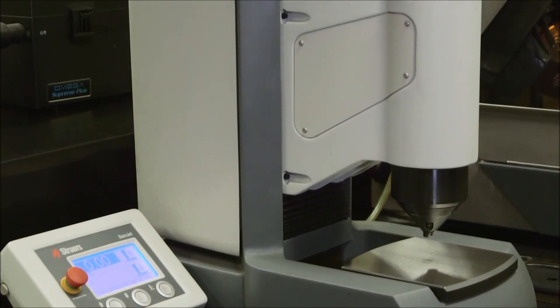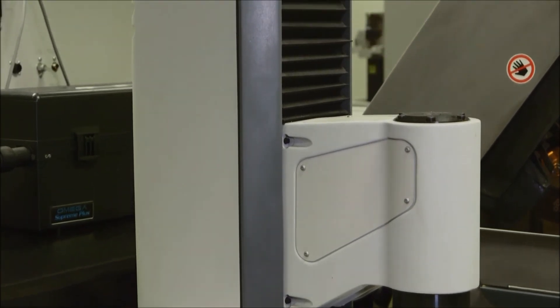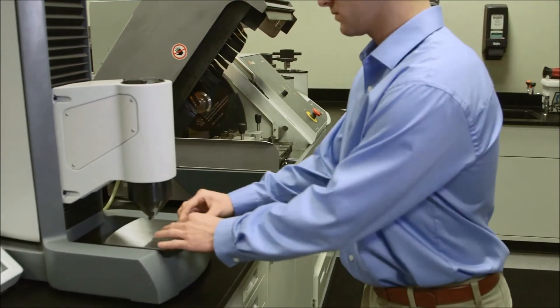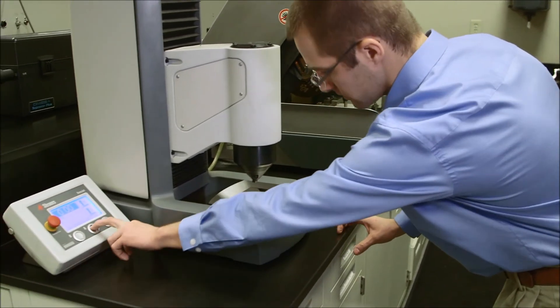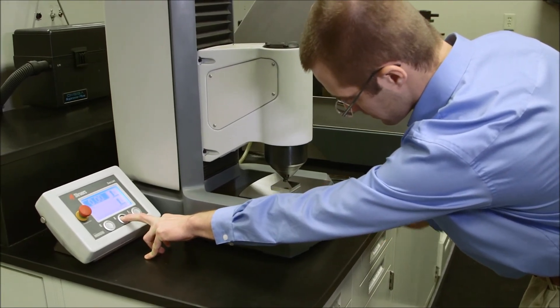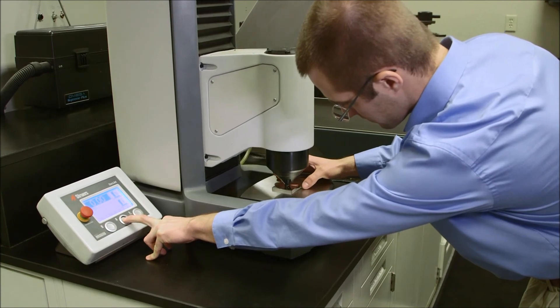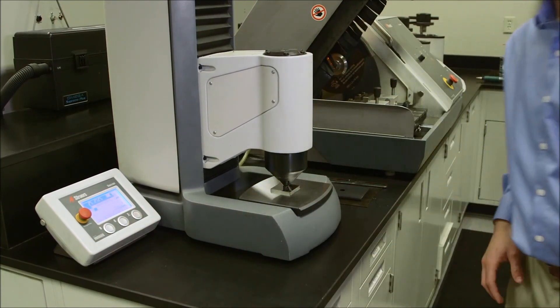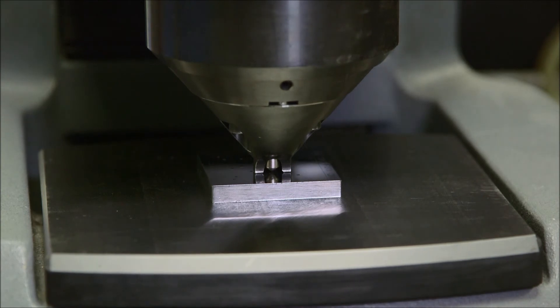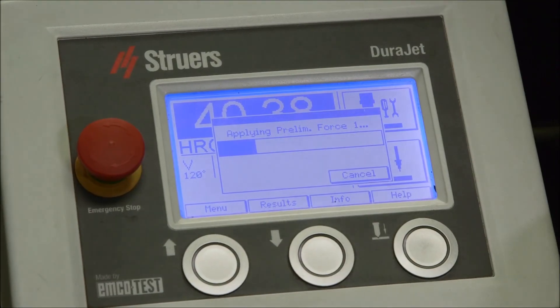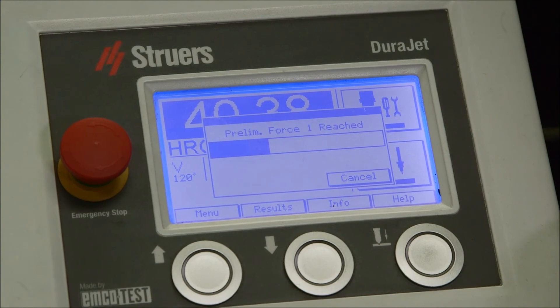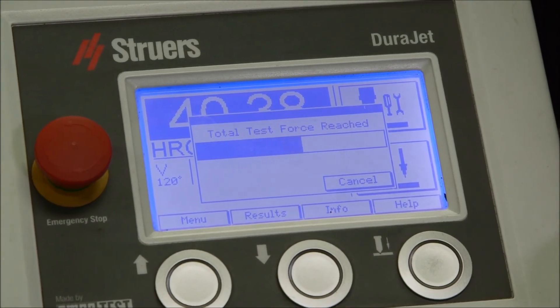A key characteristic to any material is the hardness of the material and what we do is we have a Struers Durajet hardness tester that tests multiple different hardness scales. We can test the Rockwell C hardness which is typical for testing a heat treated steel. We can test the Rockwell B hardness which is typical for as received incoming steel that has yet to be heat treated and we can also test the Rockwell A hardness which is typical for testing carbide materials. It's a very standard piece of equipment within our laboratory but it's also a very critical piece of equipment to ensure that our products have the correct hardness before going out into the field.